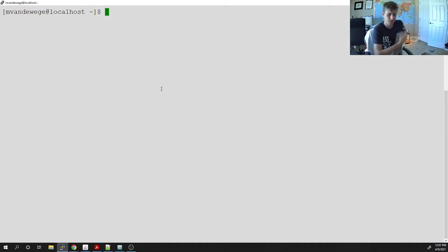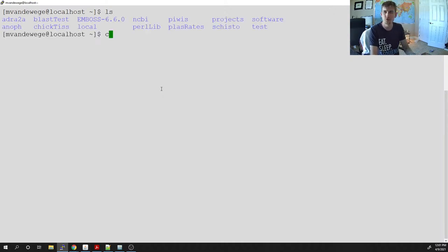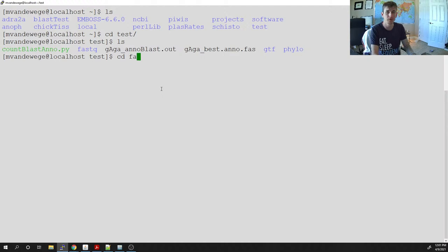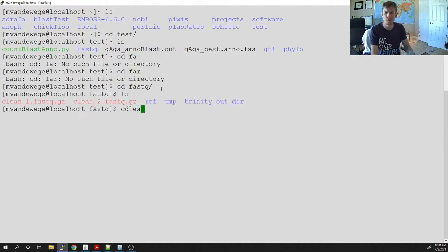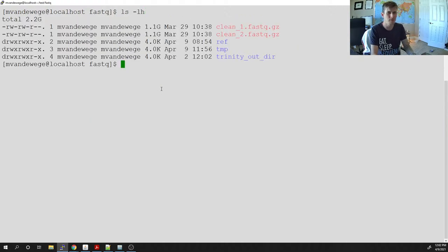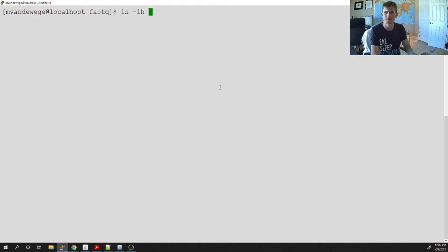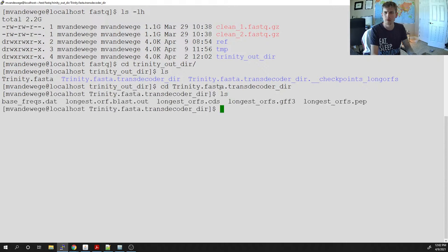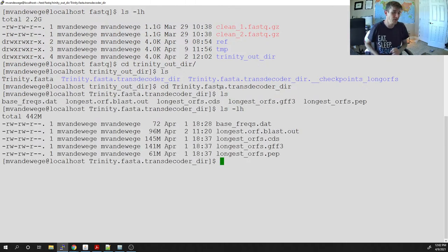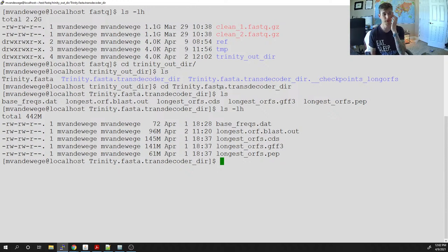Alright, I started a little bit late. By this point we should have a reference or file. Most of you are here, a couple are a little bit behind — that's okay, we don't necessarily need these files until Monday. From our BLAST output we went ahead and added our annotations to our transcripts. I've moved my transcript file around to keep my directory clean.